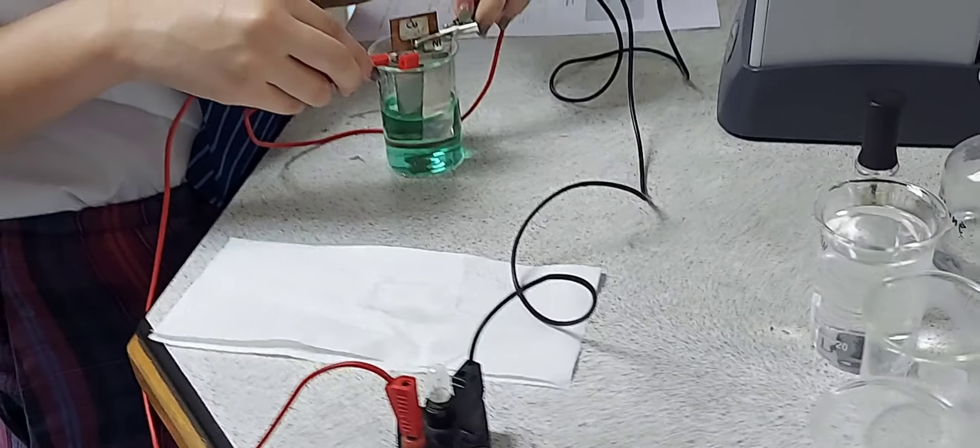You can see a deposit of nickel forming on the copper. With a steady flow of electricity, this will be an even deposit formed on the cathode.